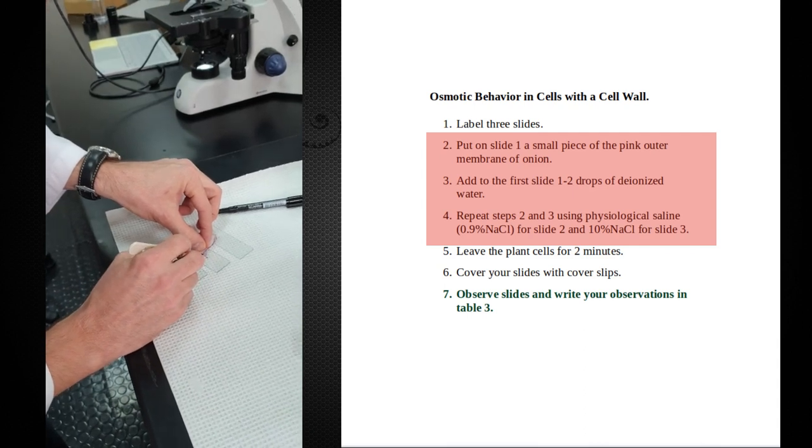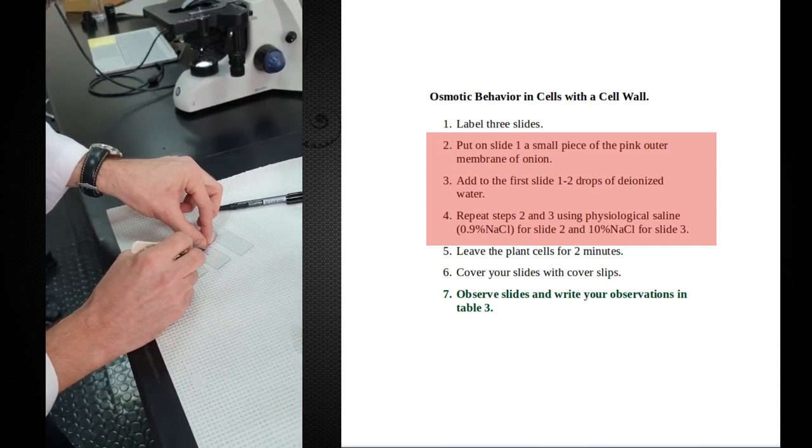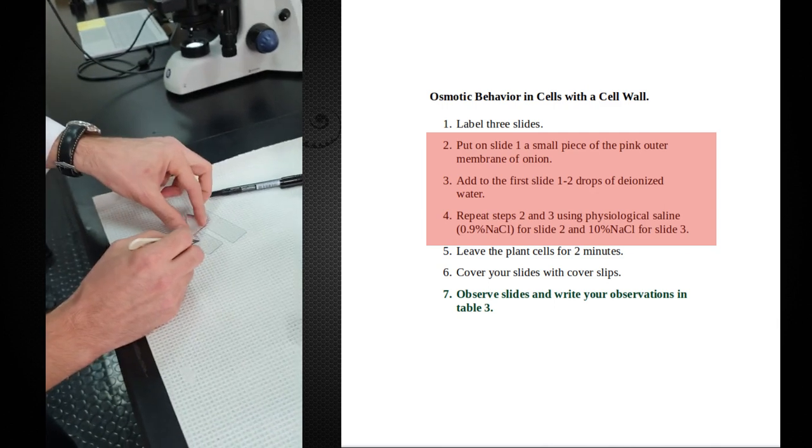And the key here is try to make sure that what you have is a relatively flat piece of onion. If you just pick the red part, it's a very thin membrane.